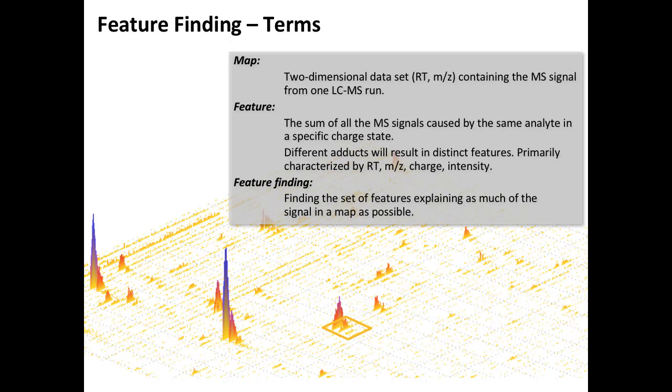Remember what I told you on the first day. If you have more resolution in this narrow range, you can also start seeing this isotope fine structure for metabolites in contrast to proteomics. So there are a few differences, but ultimately that's still what it looks like.